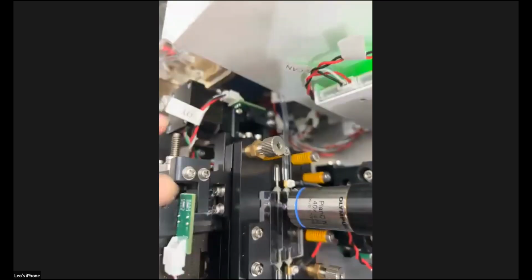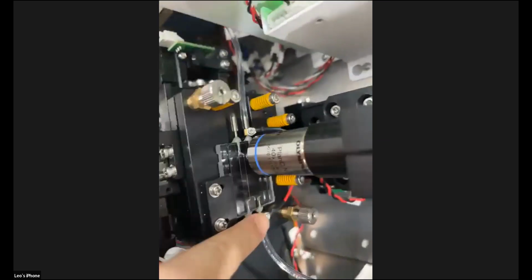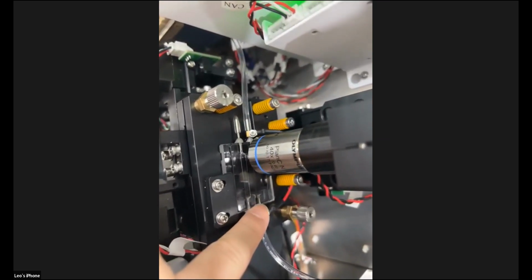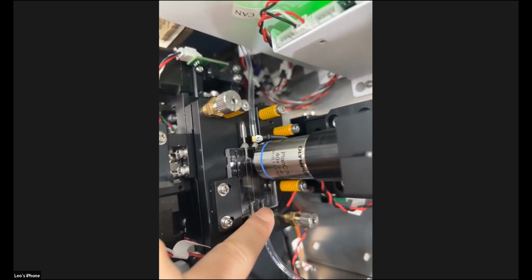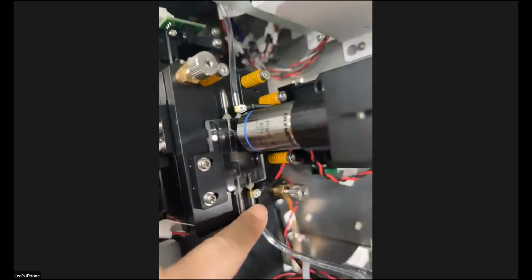You can see from here that there are two screws that connect to the metal tube of the slide of the flow cell, the flow chamber. I'm not sure if you can see that.